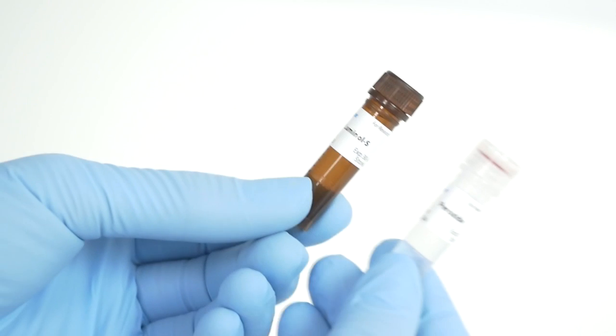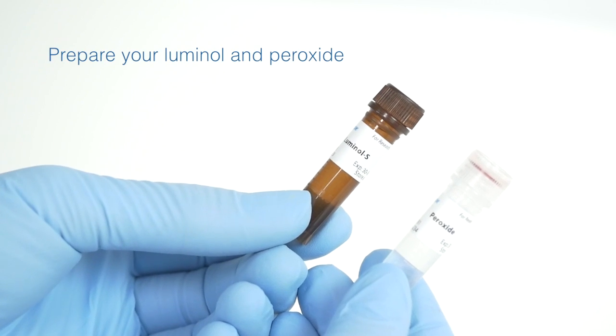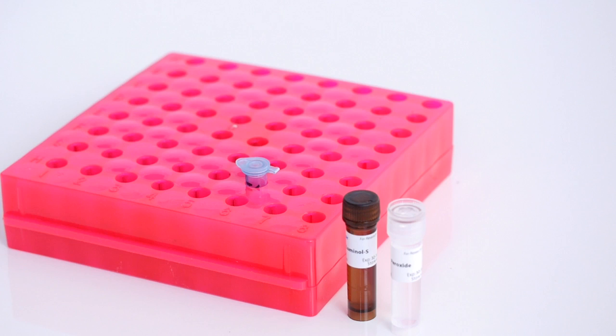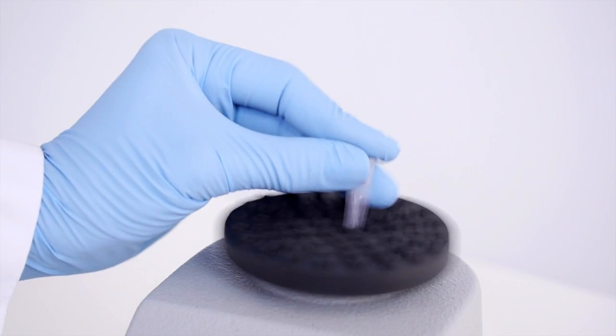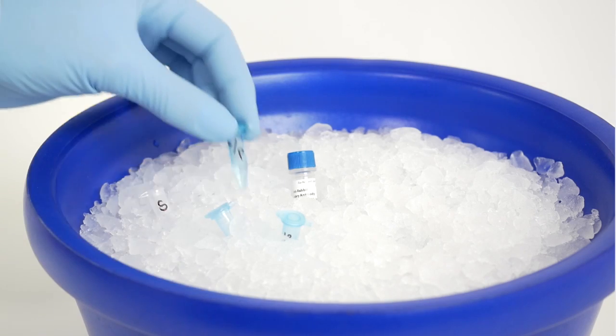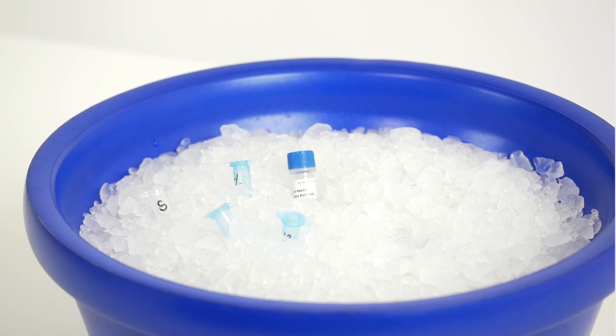And finally, the last thing you'll want to do is prepare your luminol and peroxide. All you'll need to do is combine 150 microliters of each into a microcentrifuge tube and then vortex and place on ice. And that's it. Wasn't that simple?